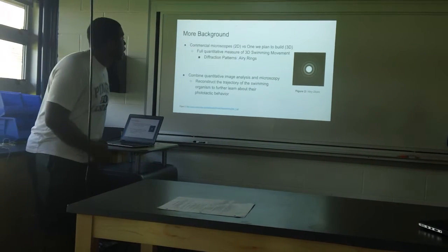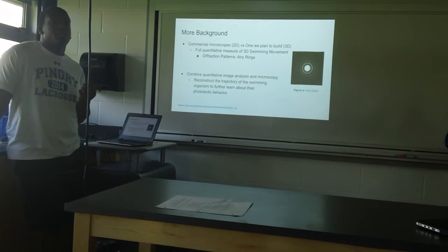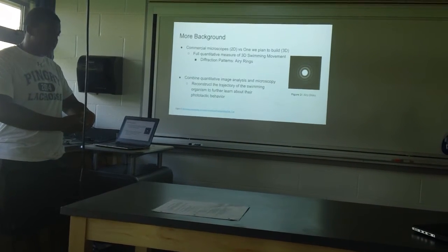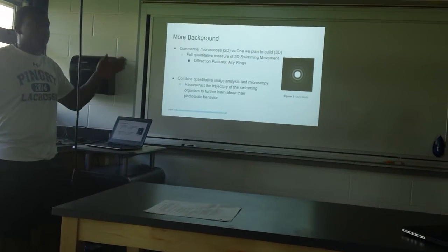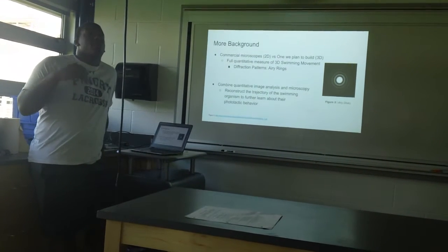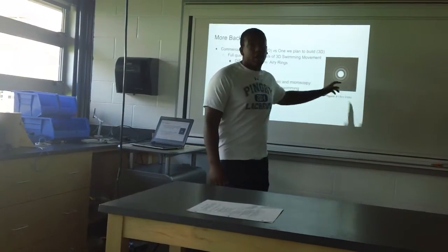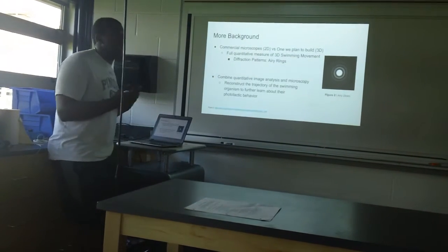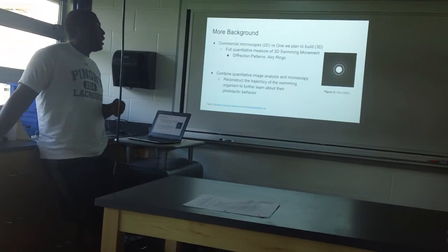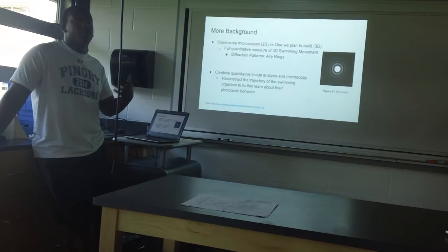The way our microscope would work would be that we would utilize 2 dimensions. There would be a stand, and various devices set up along different areas on the stand, and we would be looking in 2 dimensions and tracking the 3rd dimension based off of light diffraction patterns. So that's what you see right here: the light is diffracting around the object. We would be taking the quantitative data, which would be x and y, or y and z, or x and z, and then using the light diffraction patterns to formulate the 3rd dimension.